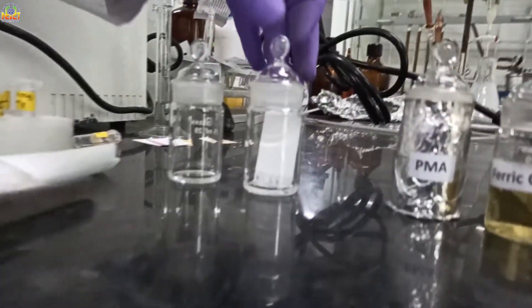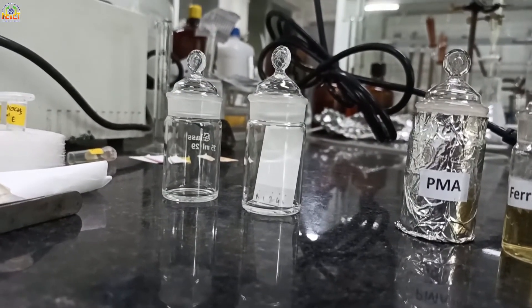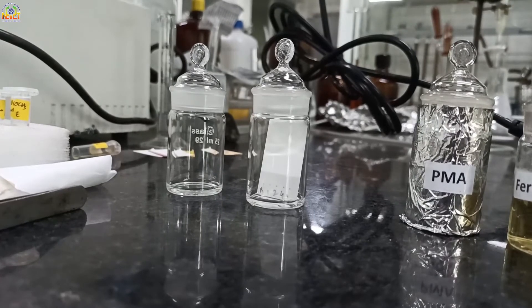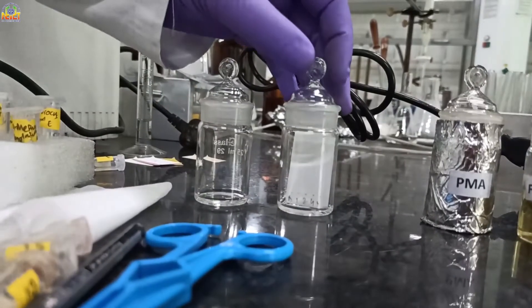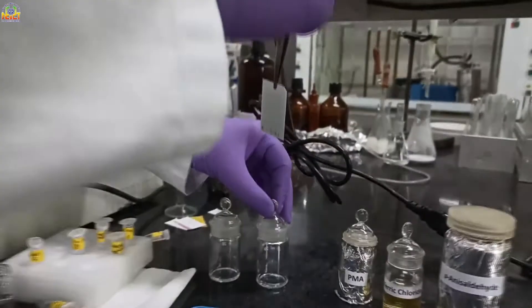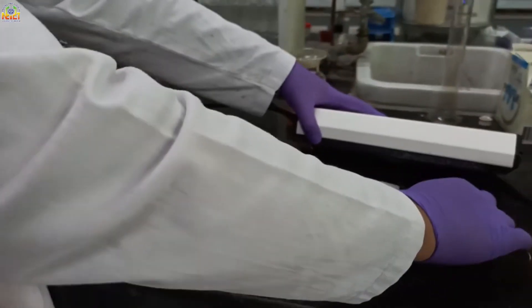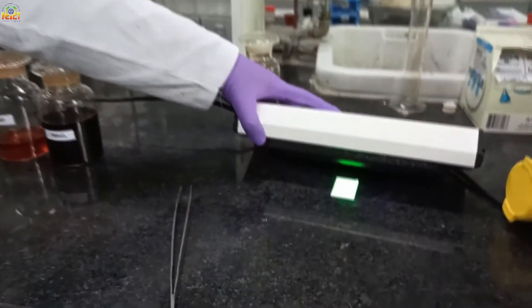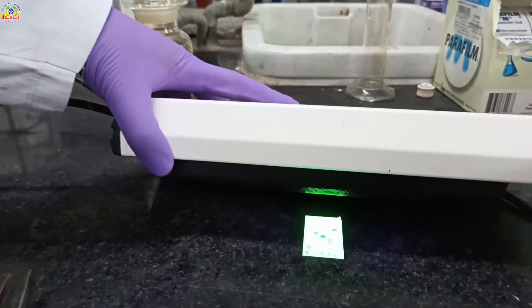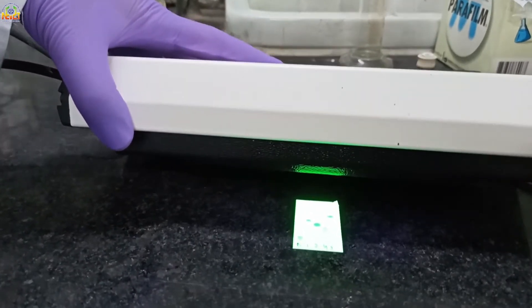Again the same procedure — solvent is running upward through capillary action. Like cloth: if you dip one end of cloth, water will go upward. The same phenomenon is occurring here. We will see this TLC in UV light again. It is a thumb rule — always look at TLC plates in UV light first before dipping in stains.